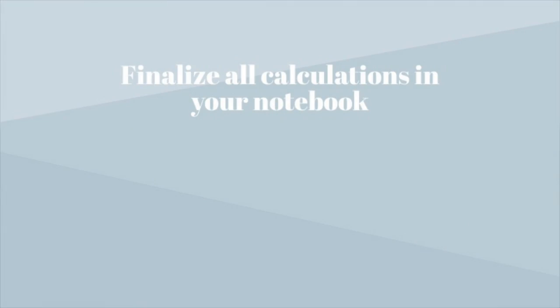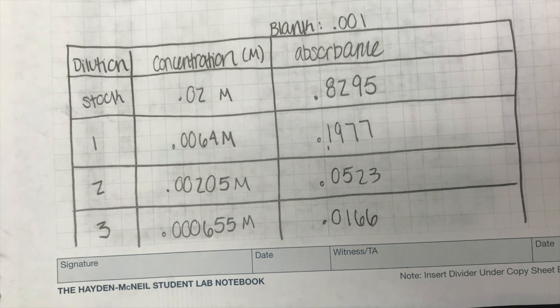Now that everything is done and you have found all the absorbance values and cleaned up your area, all you have to do is finalize all calculations in your notebook.